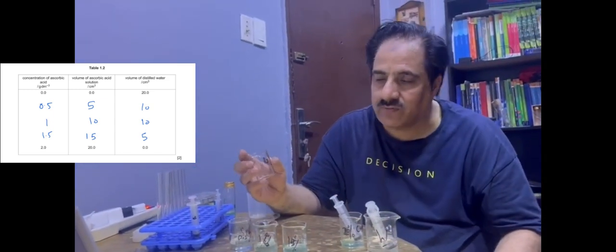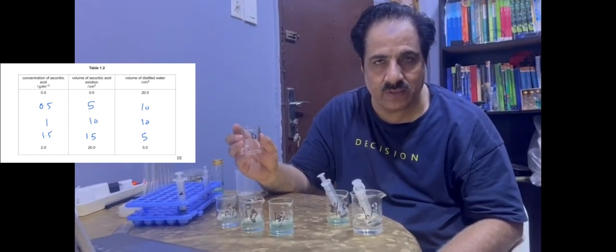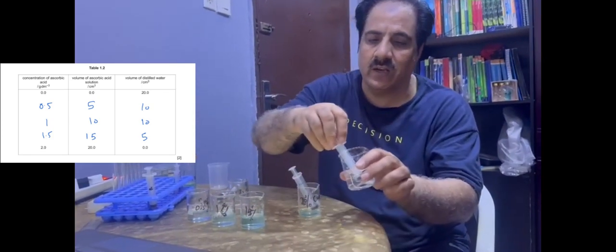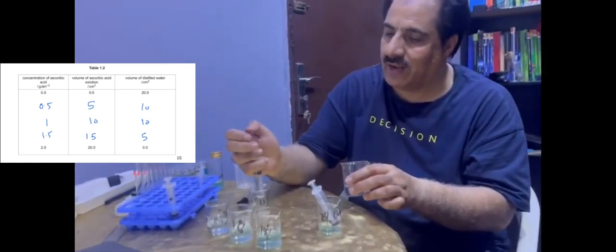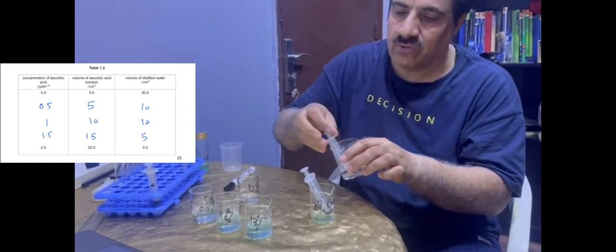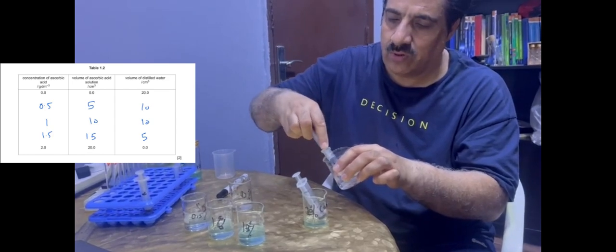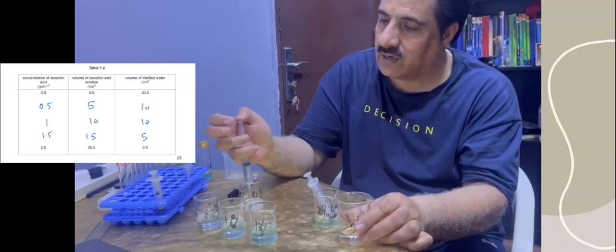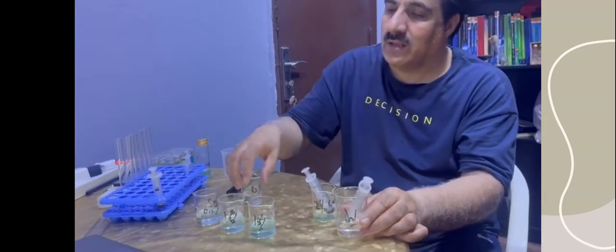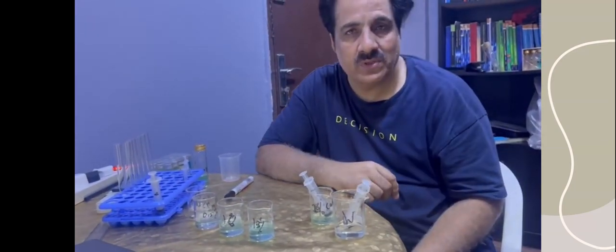And the last one is where we have to make the 0% solution. That is, we will take directly 20 centimeter cube of the distilled water. We will not add any stock solution to it. So this is 20 centimeter cube. I put 10 before, the next one is 10 in it. So this is 20 centimeter cube of 0% solution.